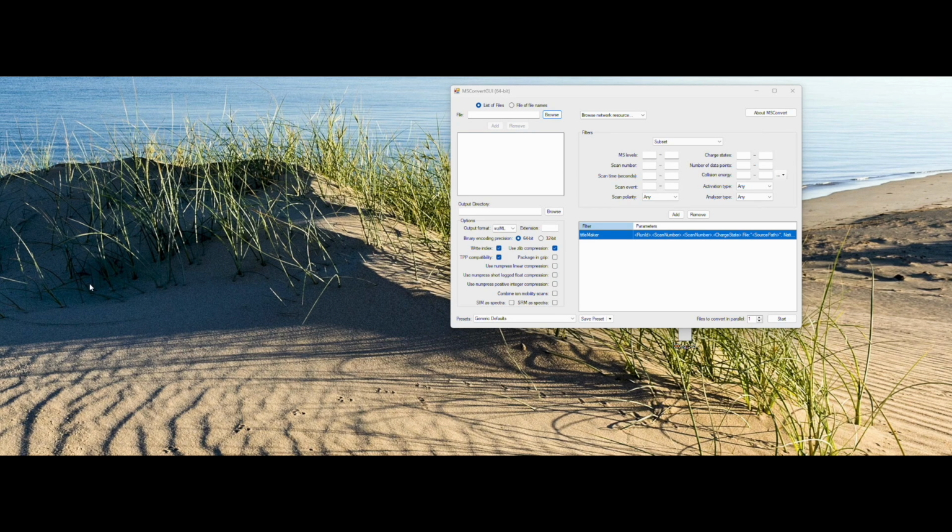Hello, this is Jim Pesavento, and I will be describing in this introductory video how to take your raw data, in this case LC-MS data from an Orbitrap mass spectrometer, and convert it into a format needed to analyze it by the pyMS-Vis application.